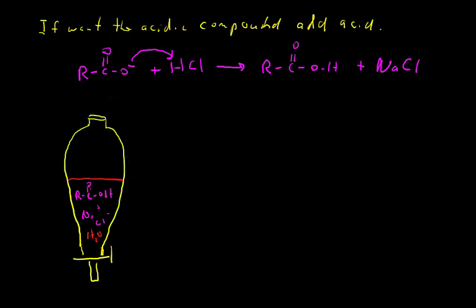So once again, I'm going to add an organic solvent, and I'll stick with ether. You have to carefully choose your organic solvent because sometimes carboxylic acids aren't very soluble in ether, for example, in which case you'd of course choose a different solvent. The solvent has to be immiscible. And so here's our ether.